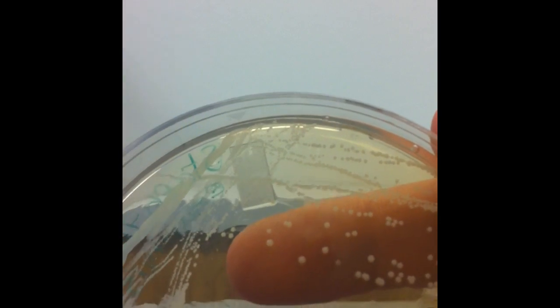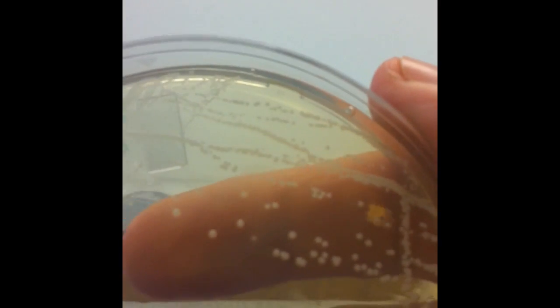This looks like Staphylococcus epidermidis, and it is. And the thing to notice about Staph epidermidis is we have, again, small white round colonies that are smaller than the other staph that I just showed you. Here is Staph aureus. Here's Staph epidermidis. Nice, tight, small white colonies that are round and smooth. Convex, by the way, as well.